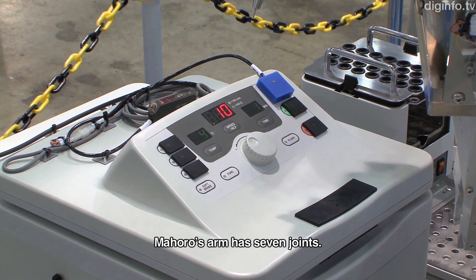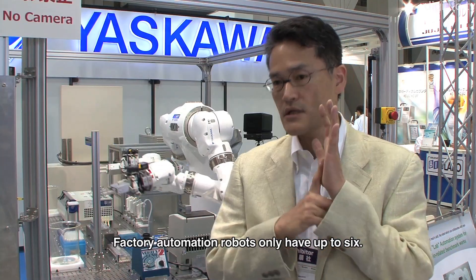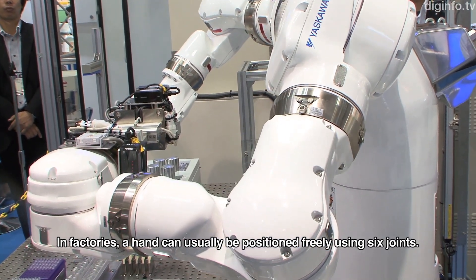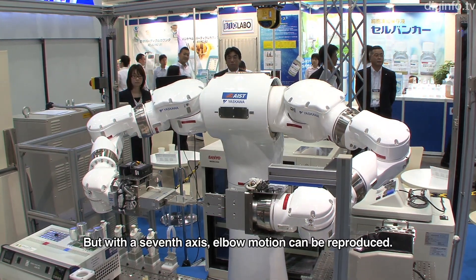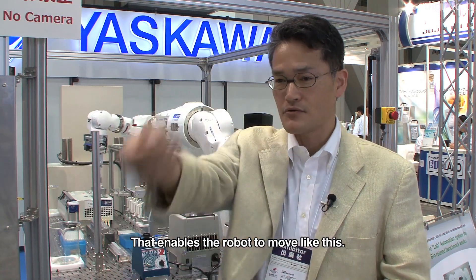There are seven joints in Mahoro's arm. For factory automation robots, six joints are typical, which allows free positioning. But with seven joints, it can recreate more complex human-like movements, including the ability to navigate around obstacles.